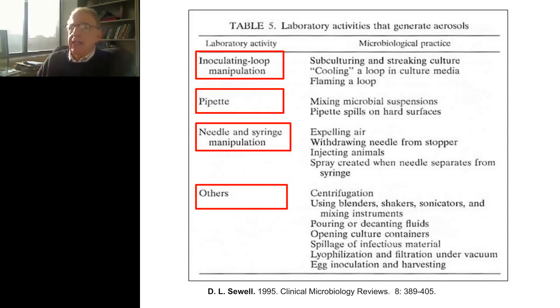If you're pipetting, and depending on whether you're just transferring or you're pipetting to break something up to mix a microbial suspension, that can cause generation of aerosols. Then, of course, needles for syringe manipulation, and then others like centrifugation, vortexing, decanting, things like that, all cause the risk of aerosols. All are steps that generate aerosols.